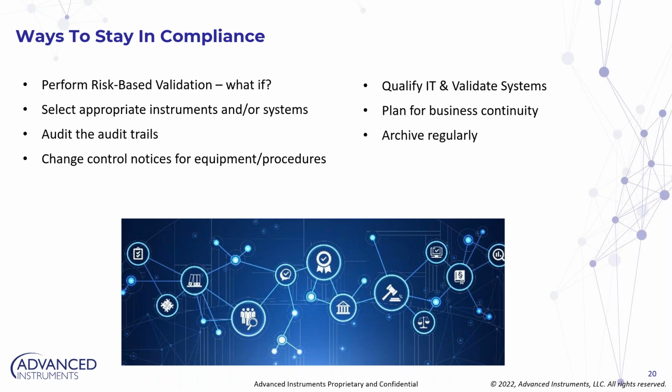So as a compliance as a whole, data integrity as a whole, when we talked about it in the beginning, we said it was from the start to beginning, generation of data to all the way at the end of the life of that data set, right?